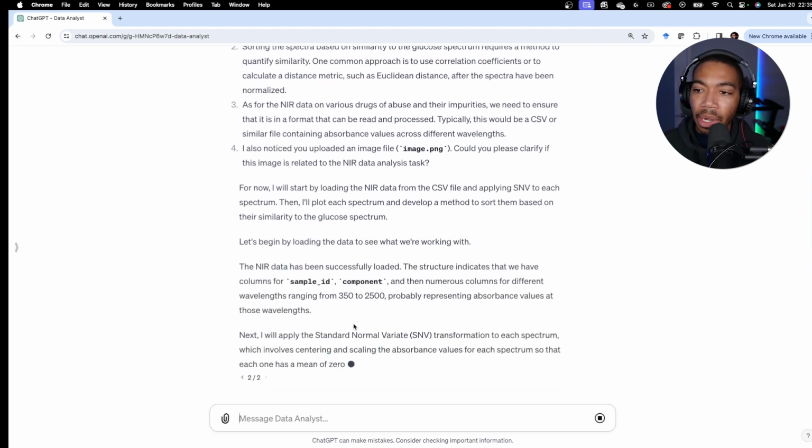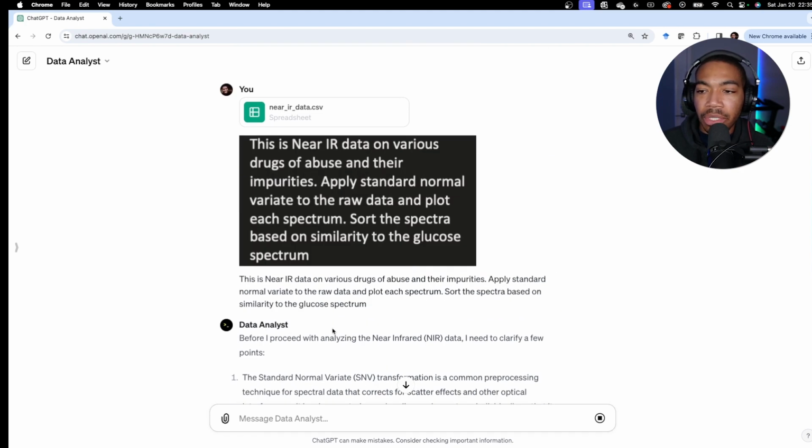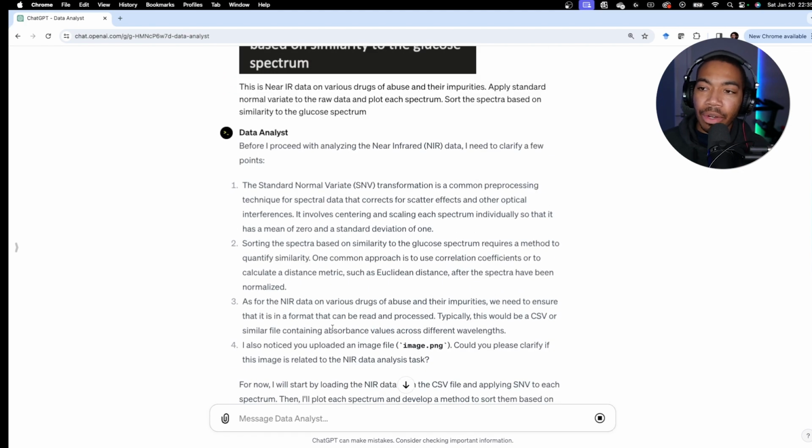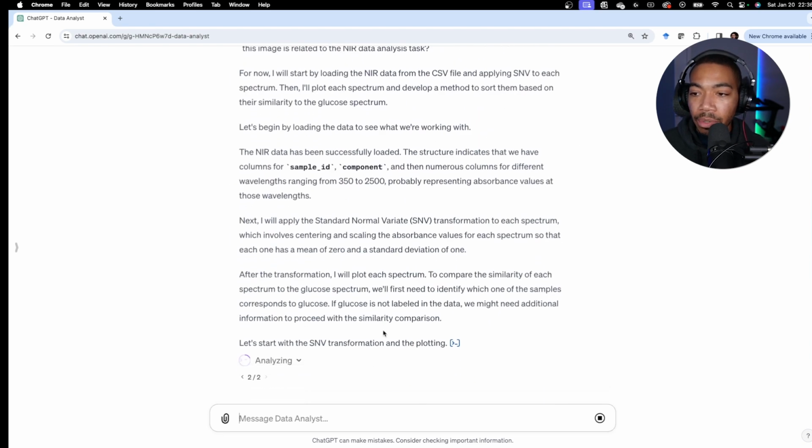So now it's redoing all of that analysis in the beginning. While asking multi-step questions is maybe more convenient and very human, perhaps breaking this down into smaller components would have been more advisable. And you see why. If we need to regenerate, then it's going to run through all of that analysis, when the first 60 to 70% was good, and maybe we could have just written a line for the final bit of data. So we'll see how it handles this.